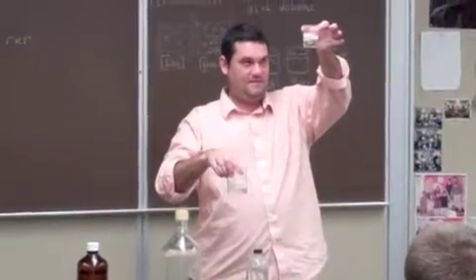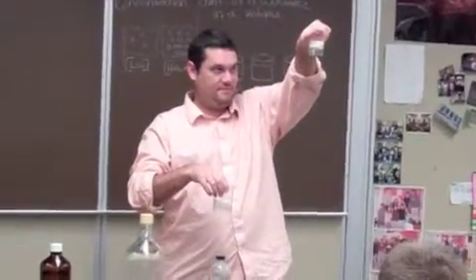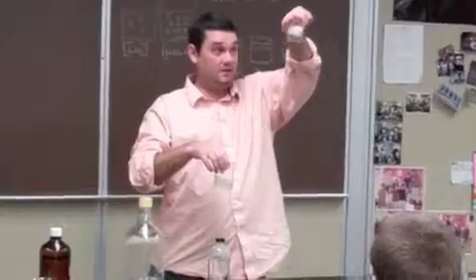Hey, could you turn it? Yeah, you have the tape change. Oh, sorry. Where do the bubbles go? The bubbles are bigger, it looks like.